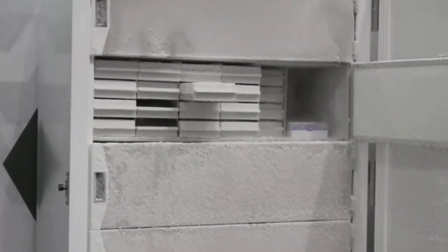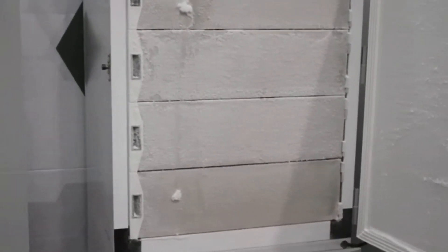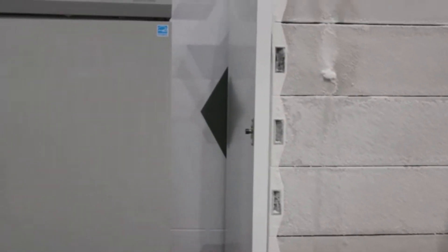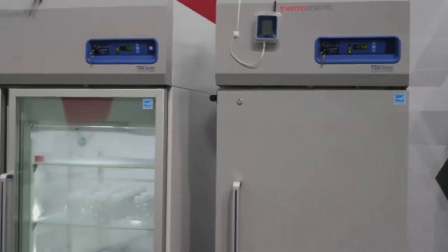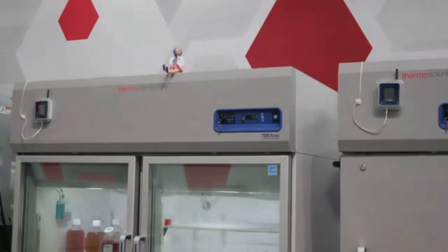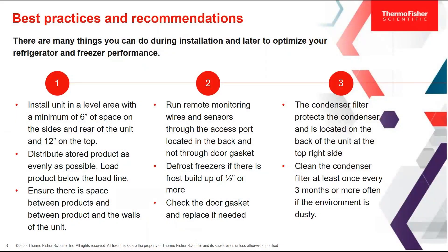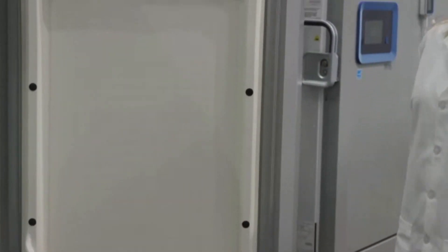The freezer looks great — the frost doesn't look like it needs a defrost anytime soon. The space between the units looks really good, and the box on top has been removed so there's nice clearance between and above the units. The product inside is distributed evenly, the wires are running through the ports and not the gaskets, and the gaskets look like they're in good shape. Periodically inspect the gaskets to make sure they don't have frost built up and aren't torn — you can see they're nice and clean with no tears.